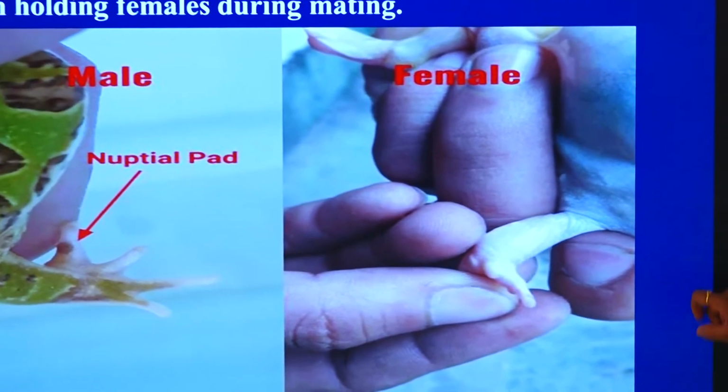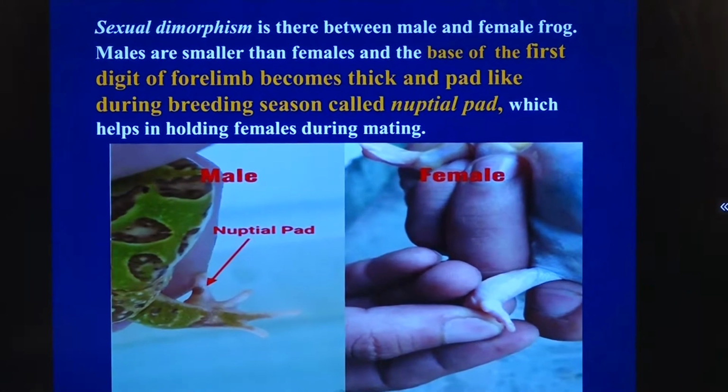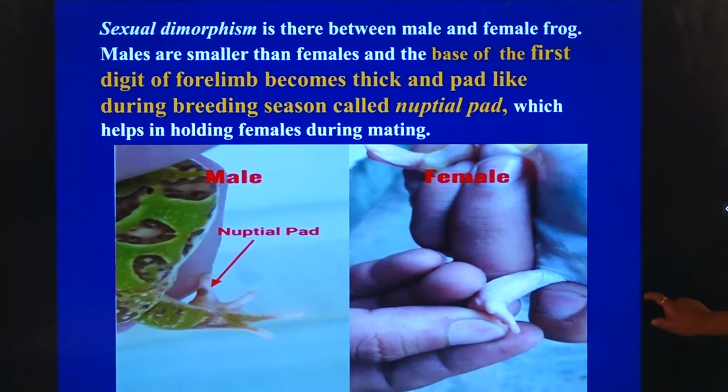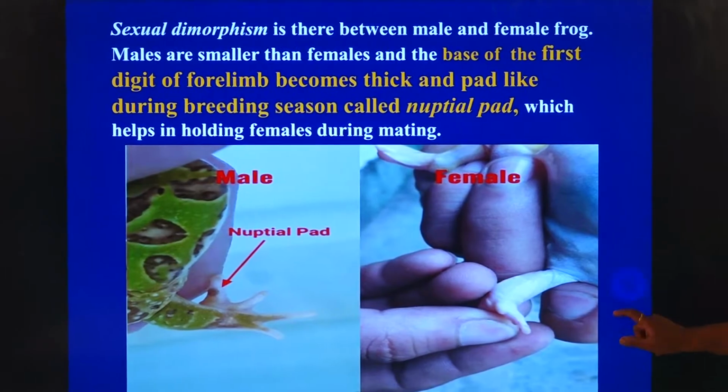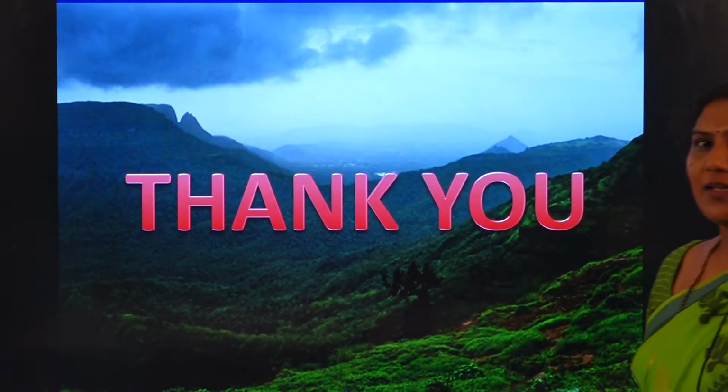At the end of the trunk portion, it bears a cloaca. It's not anus, but it bears a cloaca. That's the characteristic feature of the frog. So this is about the external morphology, children.